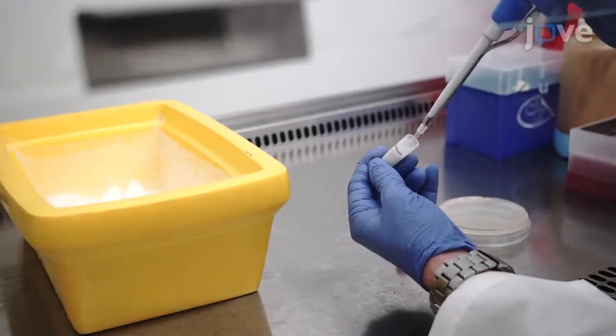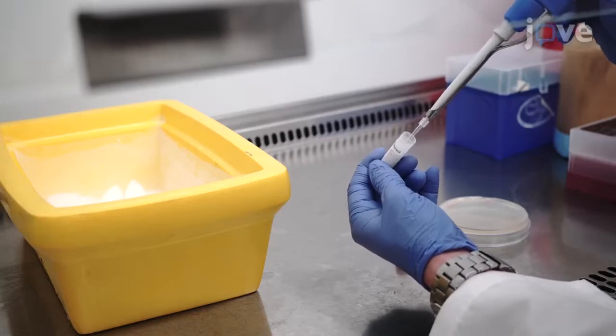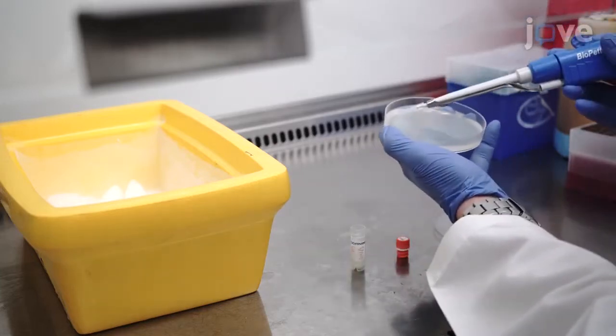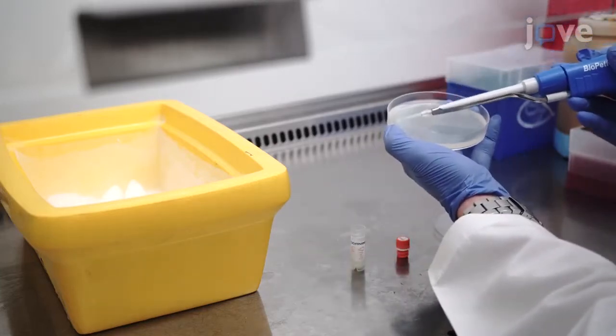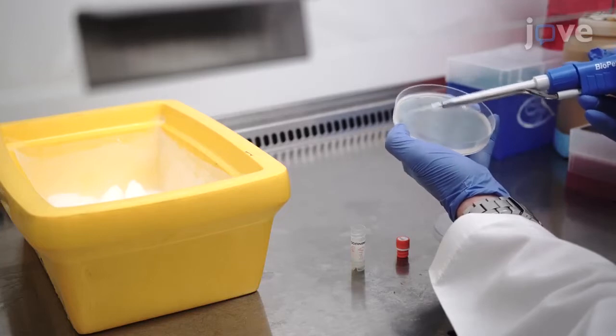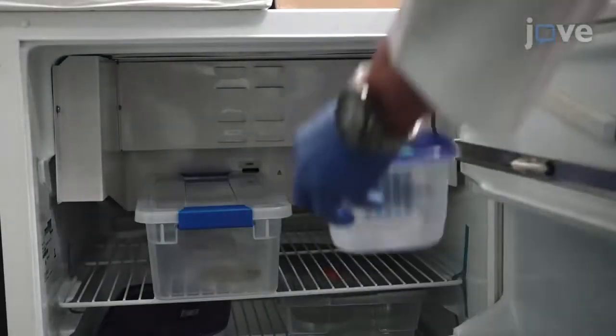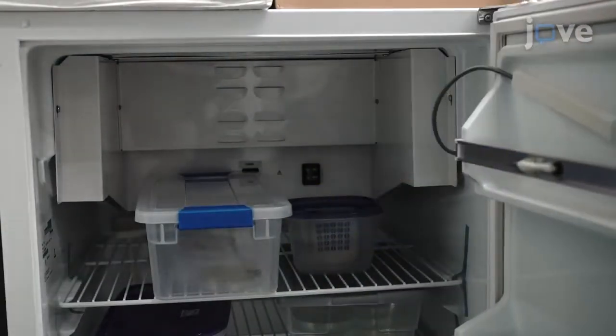To begin, while working inside a BSL-2 biosafety cabinet, streak P. aeruginosa from a frozen stock onto an LB agar plate. Incubate the plate at 37 degrees Celsius for 16 to 24 hours.